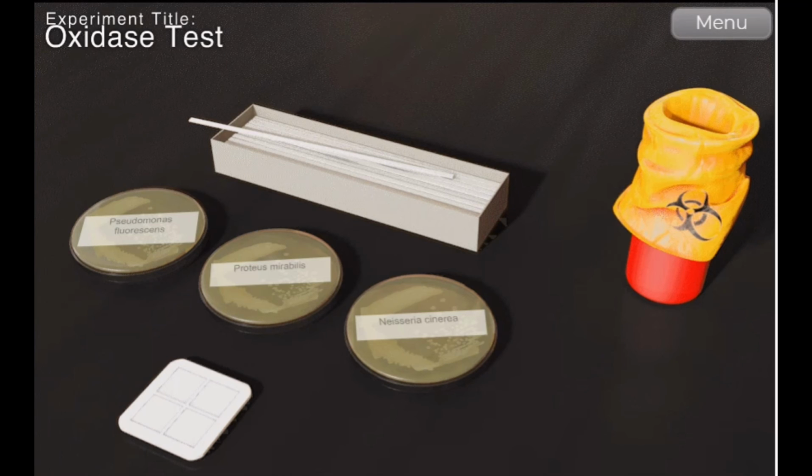Okay, for the last experiment is the oxidase test. So the purpose of the oxidase test is to identify bacteria that produce cytochrome c oxidase, an enzyme of the bacterial electron transport chain. Note that all bacteria that are oxidase positive are aerobic and can use oxygen as a terminal electron acceptor in respiration.